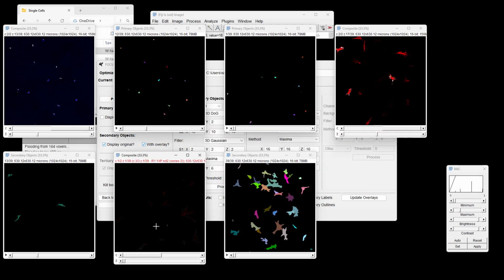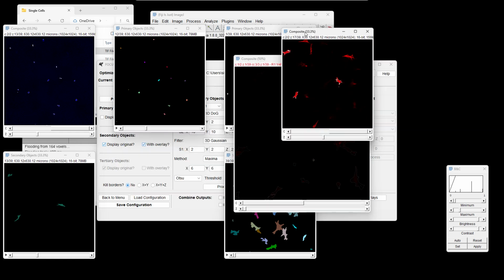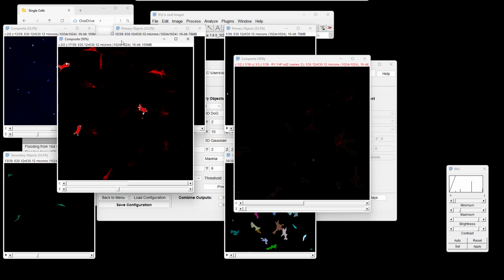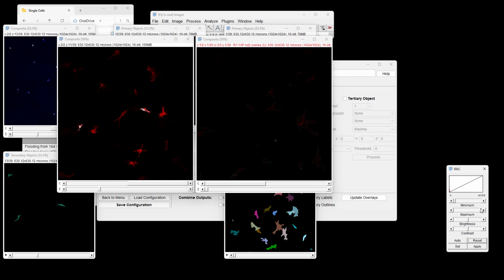That looks better. So if we now compare on the left our before and on the right hand side here our after, bump up that brightness.